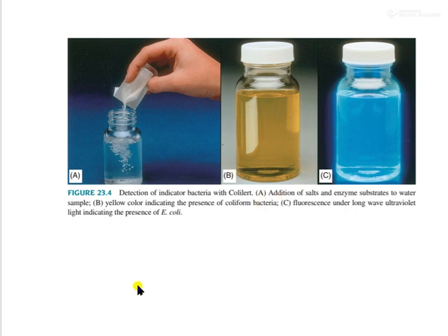So with this, we come to an end of the first session of the microbiological examination of water, and we were specifically talking about the examination of coliform bacteria, the indicators of pathogenic organisms within the water.